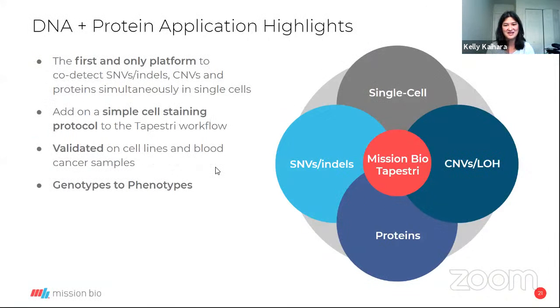With that, I'd like to thank everyone for attending. Today we were able to highlight the multi-omics capability of combining SNVs and proteins. We can also do copy number variation, which we didn't have time to explore today. But Mission Bio is the only platform that can integrate information about SNVs, CNVs, and proteins from thousands of single cells, all with one simple assay, which was enabled by adding a simple cell staining protocol upstream to the Tapestri workflow.